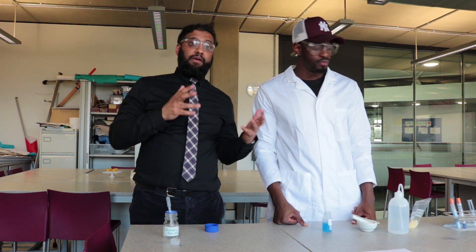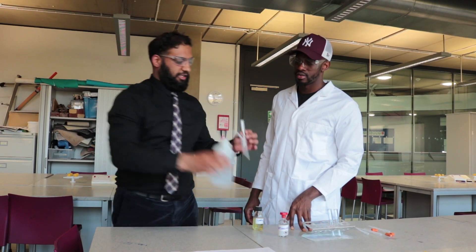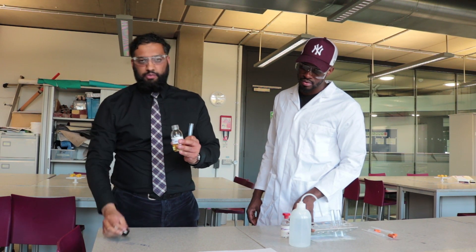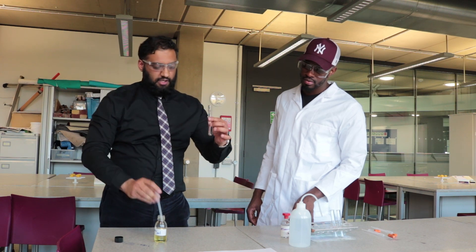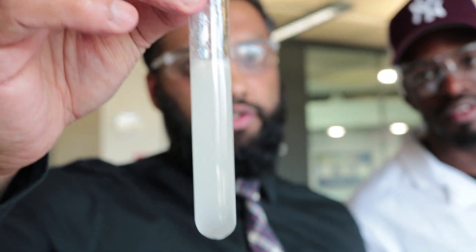We're going to move on to our last one - lipids. I'm going to show you here - it's not the actual practical - but water and oil do not mix. As you can see, the oil sits on top. Even if I put a bung on this and shake it, eventually they will separate again. So water and oil do not mix.